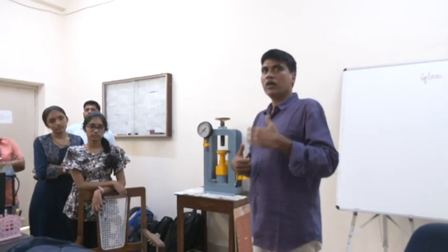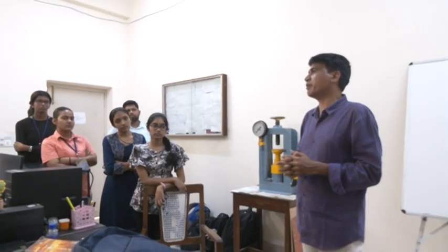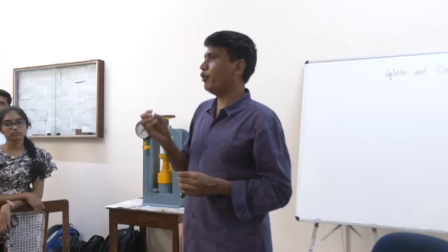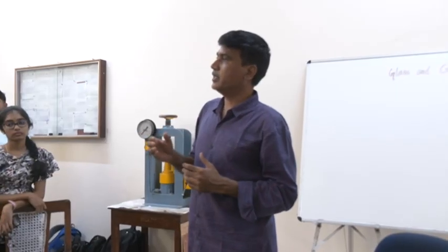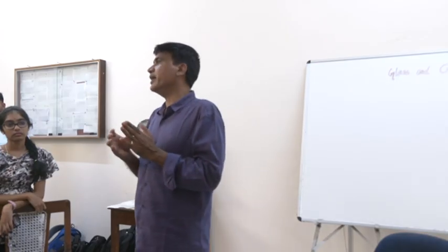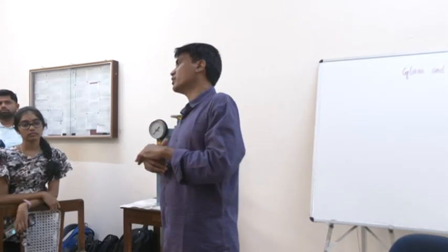And the second one, we will give a demonstration of the hydrothermal method, and use the same material for wastewater treatment by the photocatalysis technique. We are going to eliminate the dye from industrial wastewater.